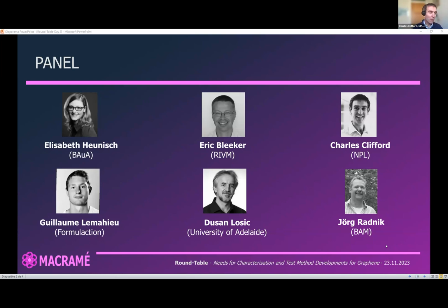It's okay. No, I was going to say it's quite interesting, the Mentimeter results, because a lot of those topics are actually being developed already in terms of standards. So things like number of layers, particle shape, lateral particle dimensions, and coming out of that aspect ratio, are forming the basis of two standards: 21356-1 on structural characterization of graphene, and also the one on graphene oxide.